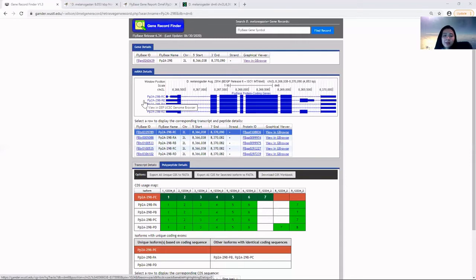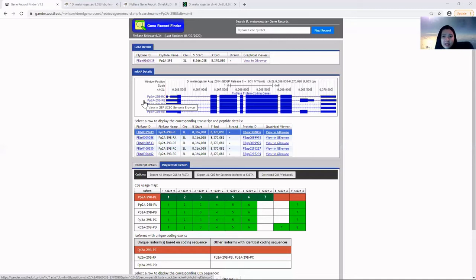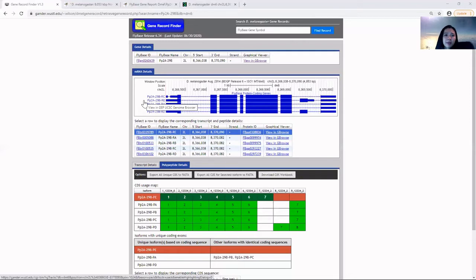Gene isoforms are mRNAs produced from the same locus but differ in their transcription start site, protein coding DNA sequence, and/or untranslated regions, potentially altering gene function.